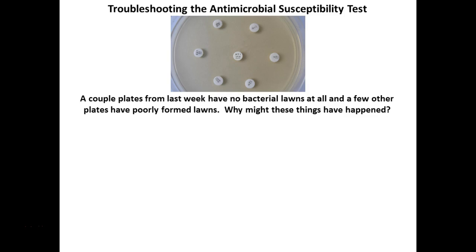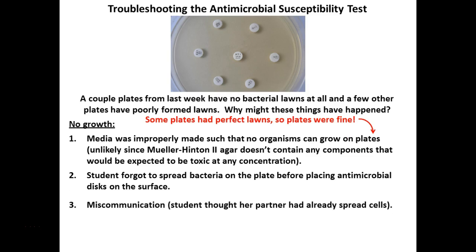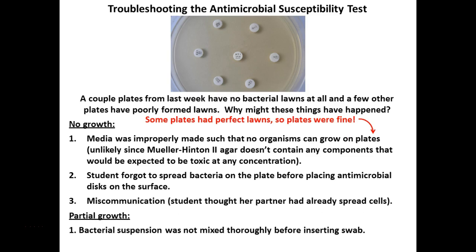Some plates, especially for Peter's class, didn't have any bacteria growing on any of the plates. Considering we had bacteria on some of the plates, it was an issue of not putting the bacteria on the plate, or miscommunication amongst the group as to whether bacteria was put on the plate or not. And if you have partial growth, it's going to make it really hard to interpret our results.